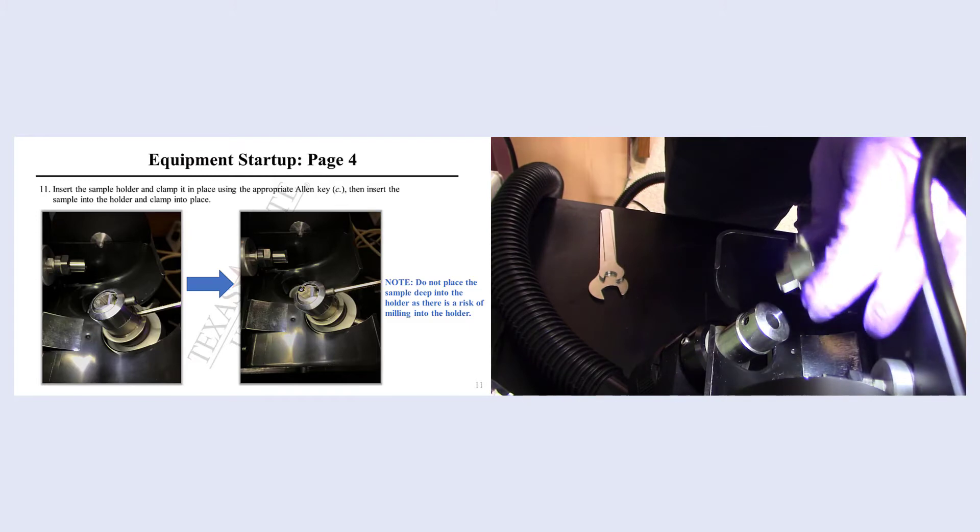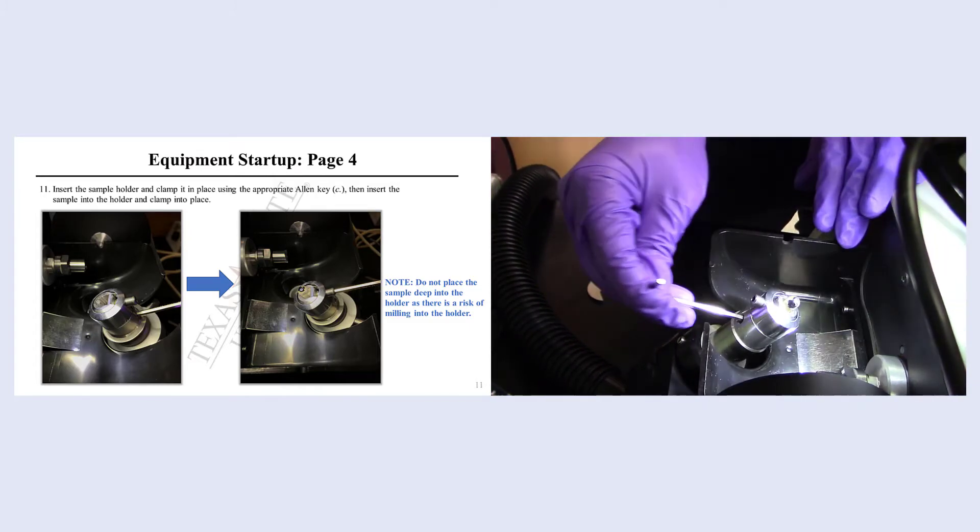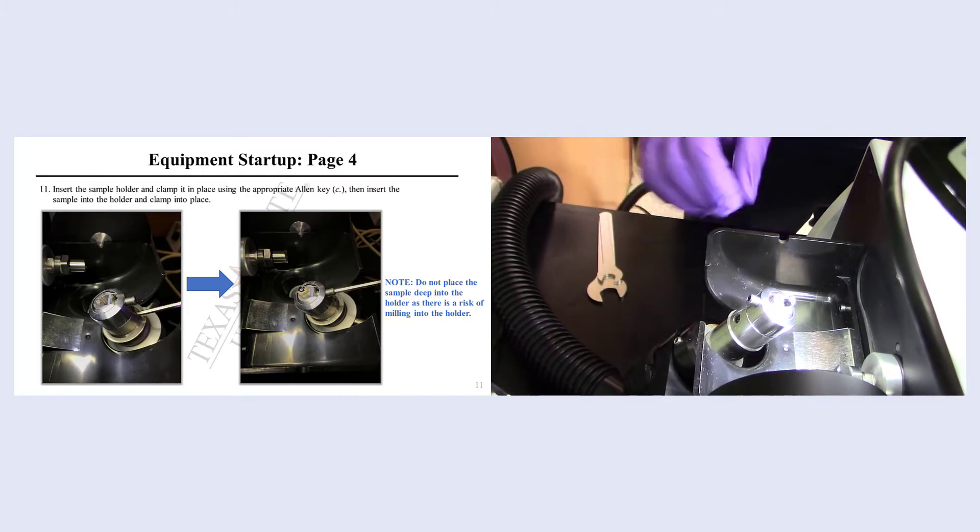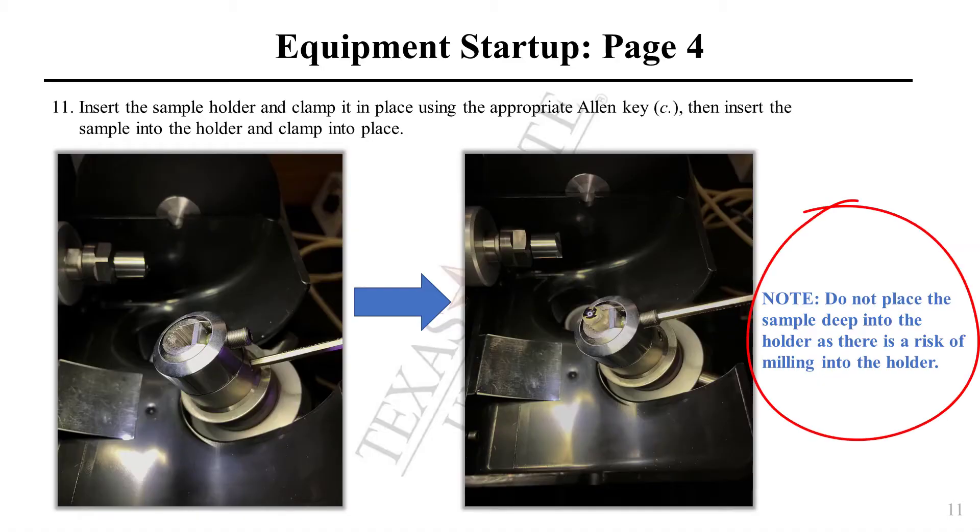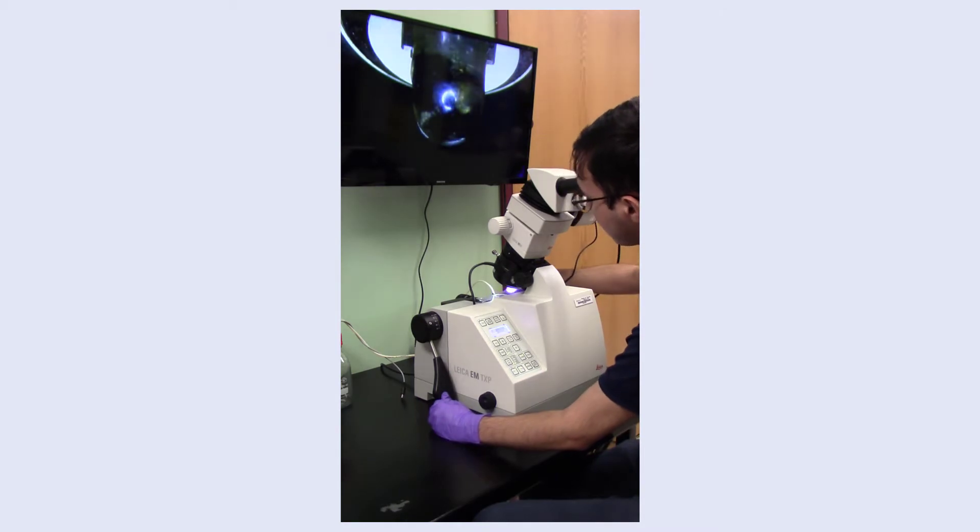Insert the sample into the holder and clamp it in place using the appropriate Allen key. Then insert the holder into the system. If milling at an angle, it is important to not place the sample deep into the holder, as there is a risk of milling into the holder. Rotate your sample to zero degrees, then replace the protective cover.